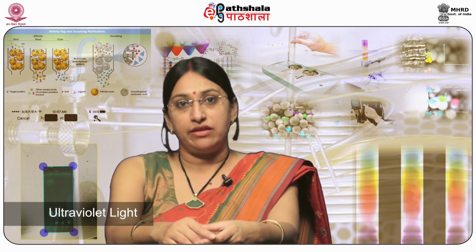Such visualization methods include ultraviolet light. Many compounds fluoresce under ultraviolet light, so we can keep the chromatogram under ultraviolet light and these fluorescing molecules can be visualized. Then there are certain molecules which can be stained using iodine vapors. Certain color reagents are also used to stain the spots of the mixture. Reagents that selectively stain the spots while leaving the others unaffected are very helpful in recognizing, identifying and visualizing the analytes.